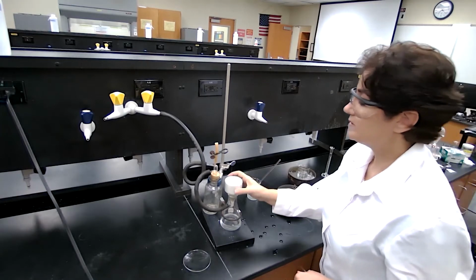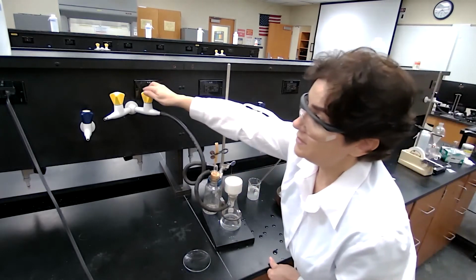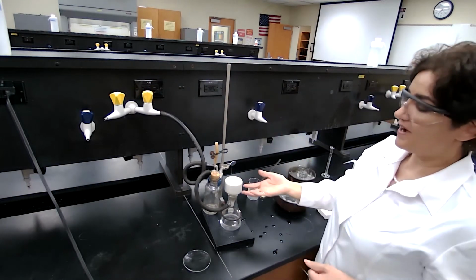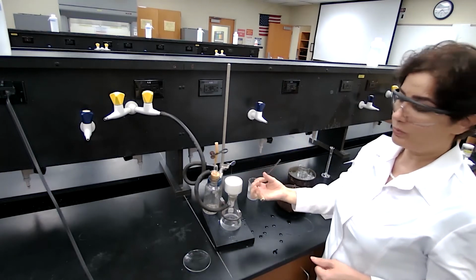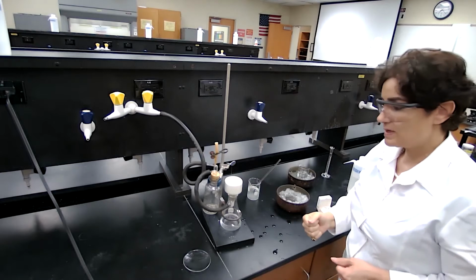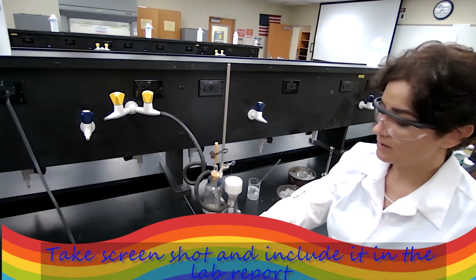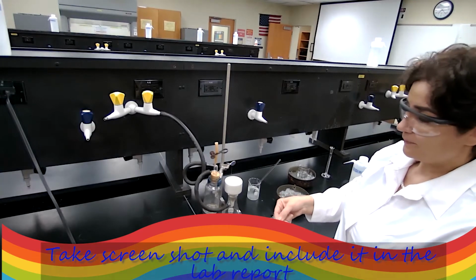Now, the crystals are washed. I'm going to continue applying vacuum for about 5 minutes to get as much of the moisture, the water, out of these crystals. After the 5 minutes, I transfer that into the watch glass that is also pre-weighed.